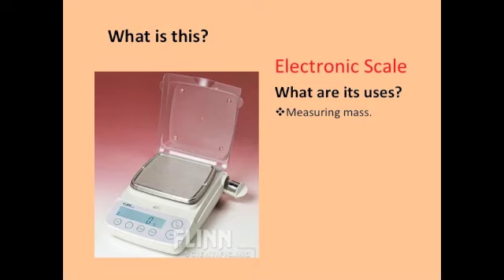This is an electronic scale. Every lab station has one. They're pretty expensive, so you want to be careful. Don't slam these things around or slam things onto them. You'll notice it has a plastic lid that's flipped up in this picture. Just make sure you flip up the plastic lid on yours before you put anything on it. Otherwise, the thing's not actually touching the scale and it won't give you a measurement. Just FYI.